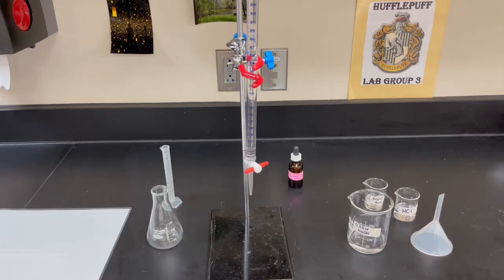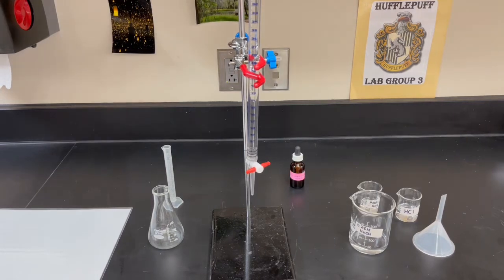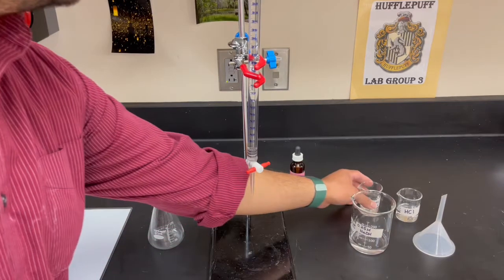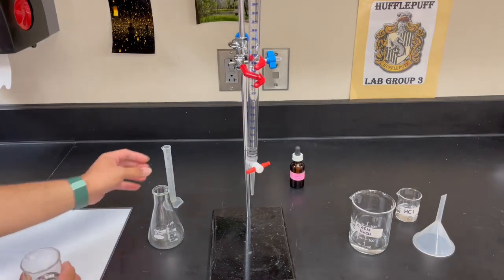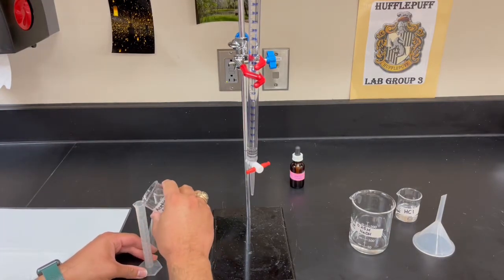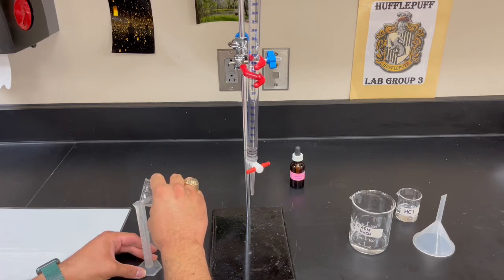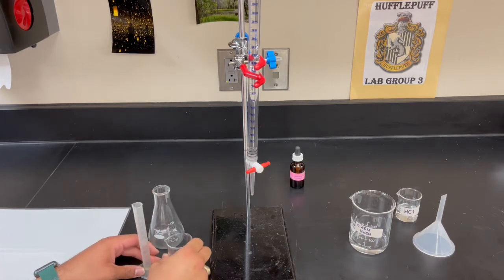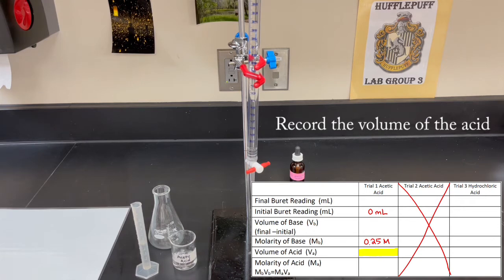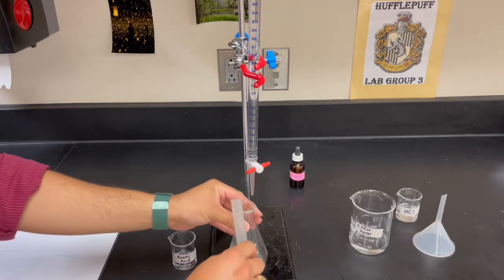So the next step we're going to do is measure out five milliliters of acetic acid. We have our acid here. We're going to measure out five milliliters. It's exactly five. And so I'm going to pour the contents into my Erlenmeyer flask.